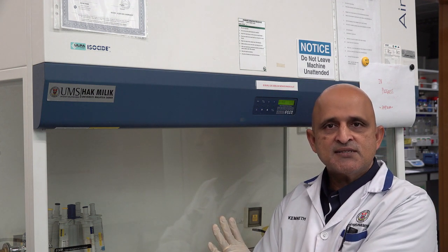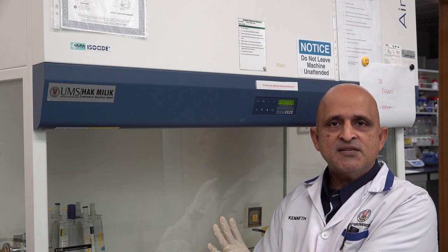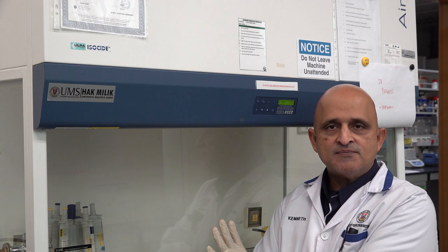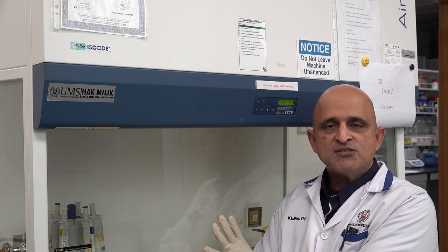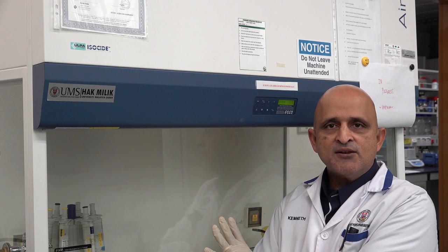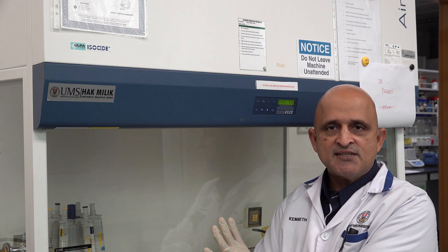This biological safety cabinet must be utilized in accordance with the administrative control or the standard operating procedures stated therein. Every biological safety cabinet must be certified periodically in compliance with your local regulatory authority or your national standards.